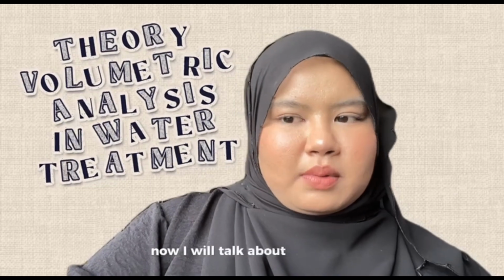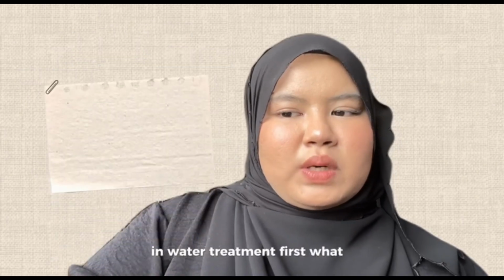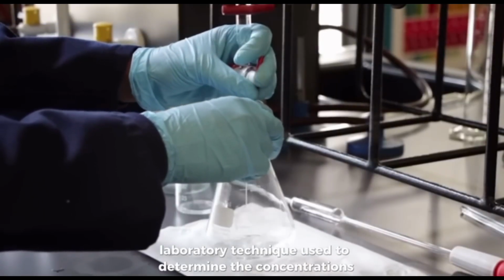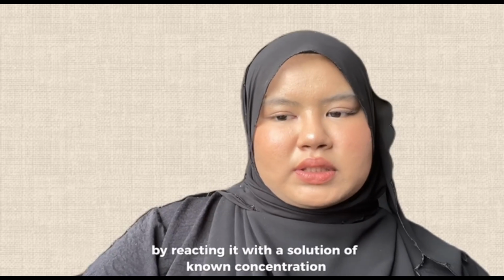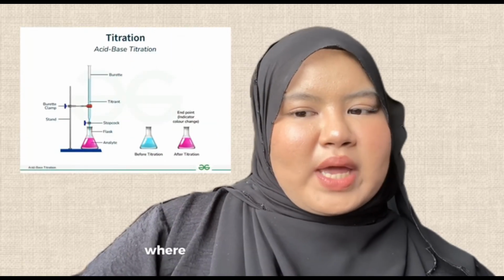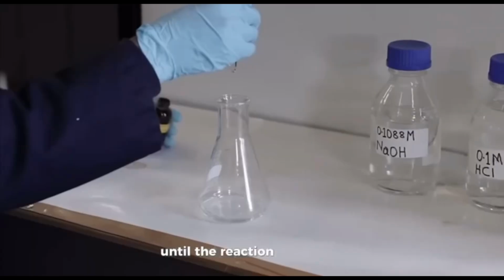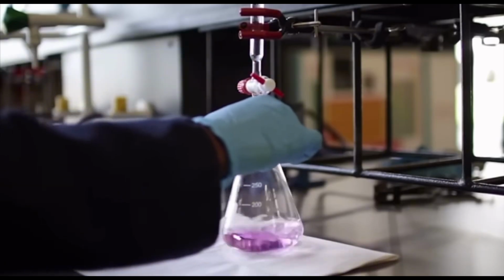Now, I will talk about the theory of volumetric analysis in water treatment. First, what is volumetric analysis? Volumetric analysis is a laboratory technique used to determine the concentration of an unknown solution by reacting it with a solution of known concentration. Volumetric analysis commonly involves acid-base titration, where an acid or base is gradually added to a solution until the reaction reaches its endpoint, typically indicated by a color change.